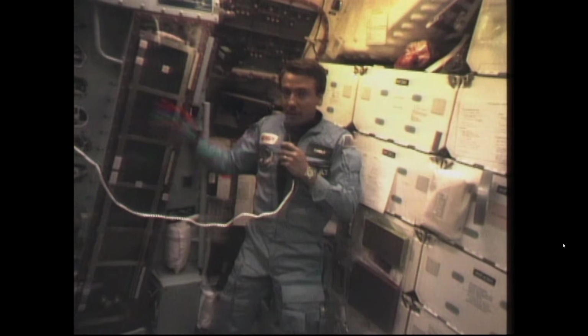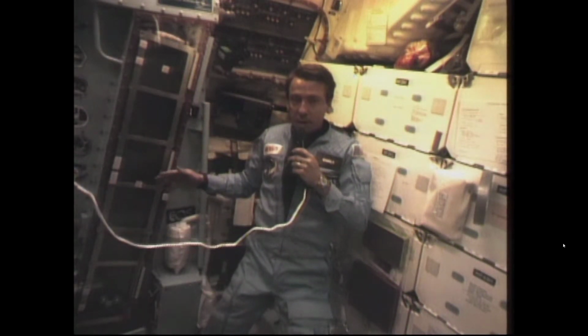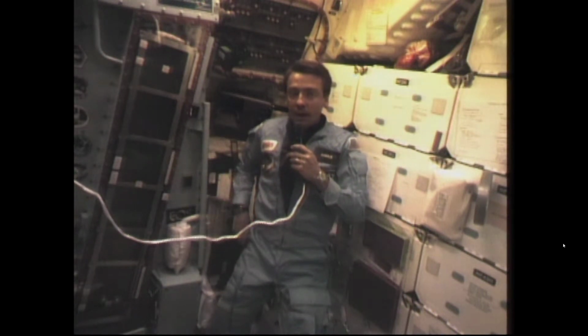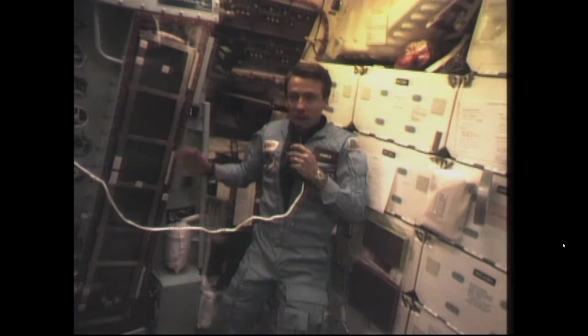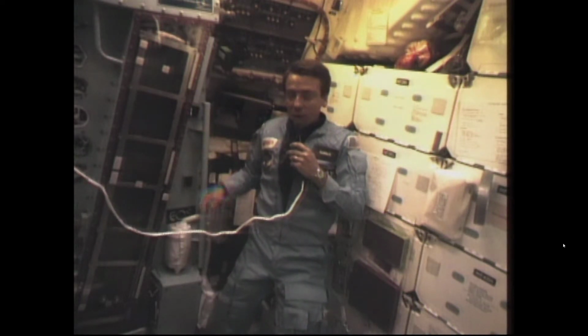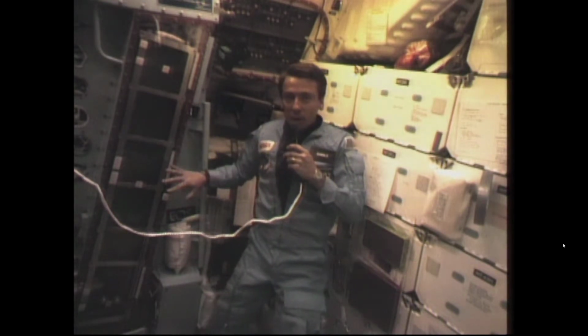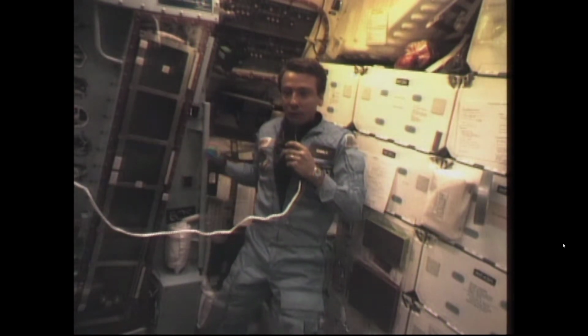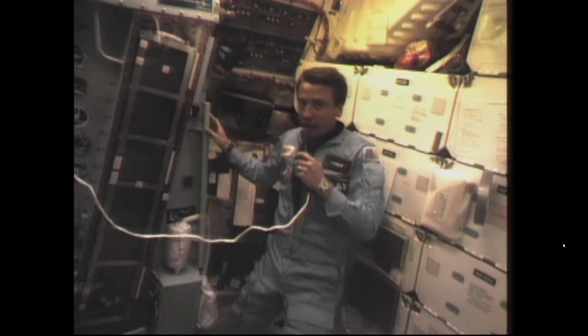In this chamber, separating sample material that contains hormone substances that we're interested in purifying. That's some ways down the road yet. We're still developing the equipment, and we're still processing hormones that must be tested for Food and Drug Administration approval, and that's some years on down the line. But we're coming along very nicely.